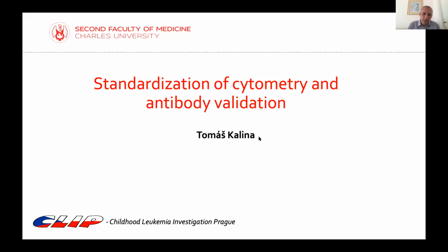Why standardization? Standardization was something that I never sought, but it found me when I was joining a Euroflow group, where I was responsible for the standardization of hematological malignancies and later primary immunodeficiencies diagnostics. And why antibody validation and how is this connected to standardization?